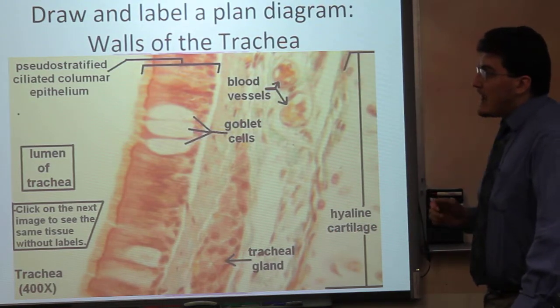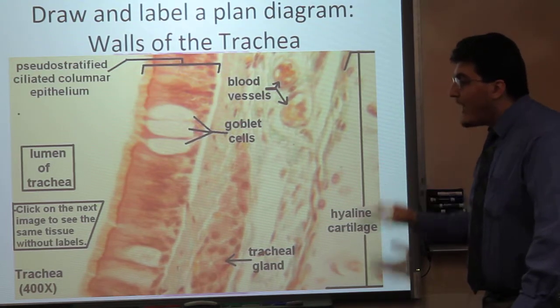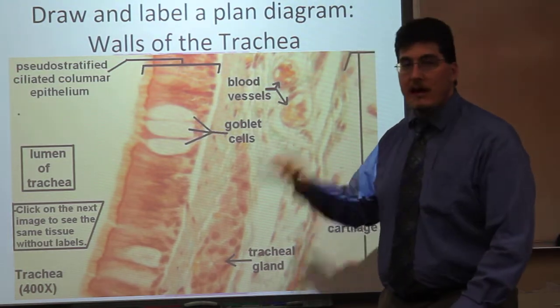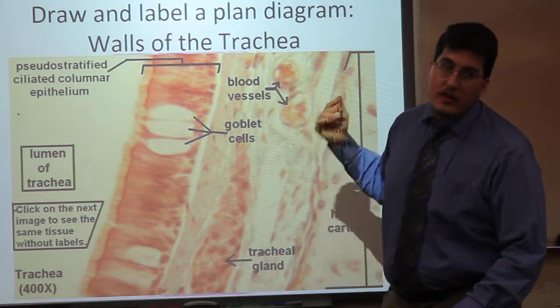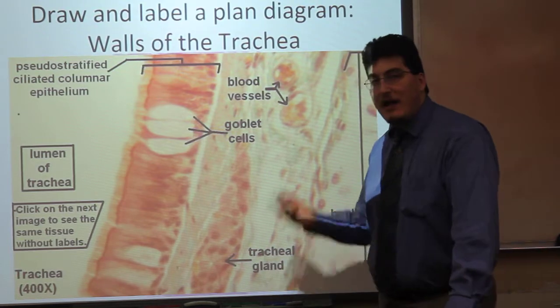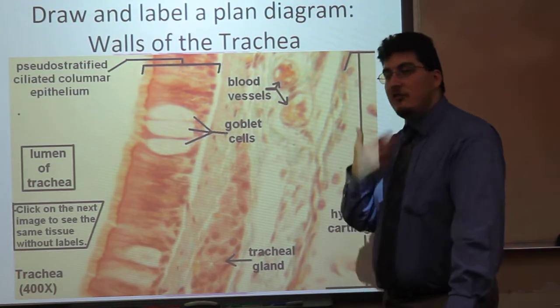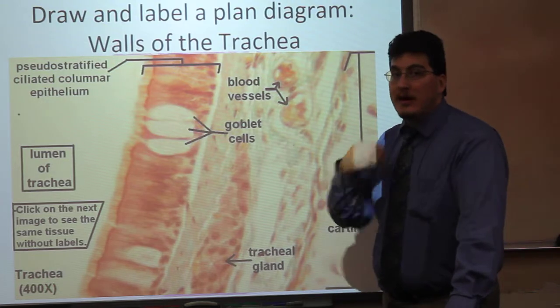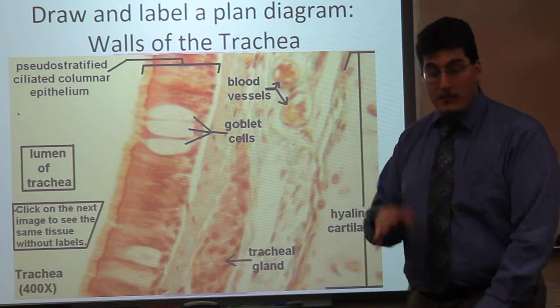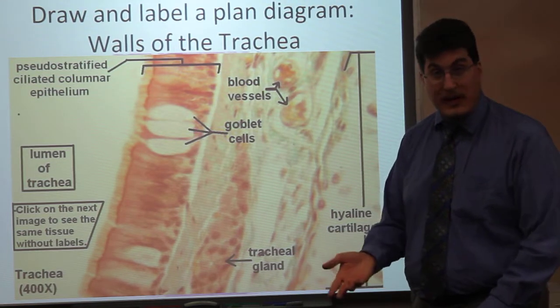The purpose of this pseudostratified columnar epithelium with goblet cells is to provide protection, and also the ciliated portion is to create sort of a conveyor belt-like motion to waft up and out trapped particles of dust and debris that get trapped in this lung, and move it up and out of your lung tissue, up into your larynx, into your mouth, where you swallow it and it gets digested by your stomach acid. Now that's not gross, that's how it's supposed to be. What's gross is when you spit it out into the public and people have to see your icky spit.